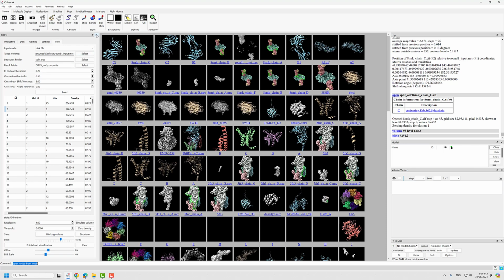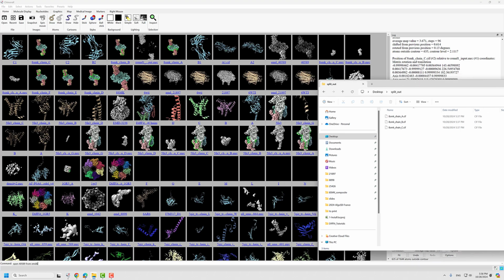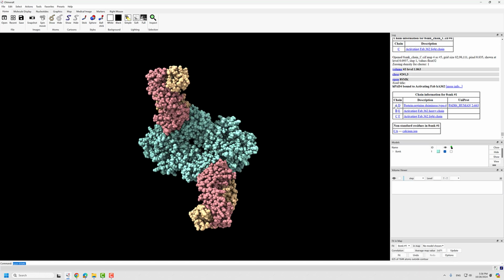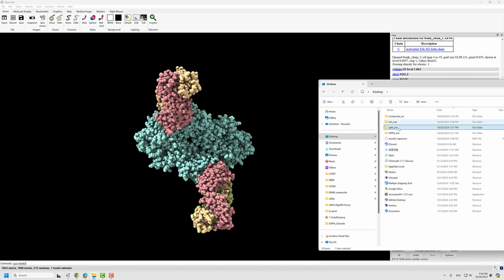We can even turn off the DiffFit tab. So open it as OK. That's what I mean by the A1 and A2. So this is A at the lower left. This is B also at the lower side. Yeah, the lower side is the first occurrence. So let's drop the result in.